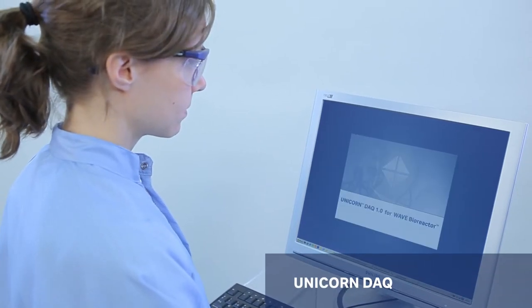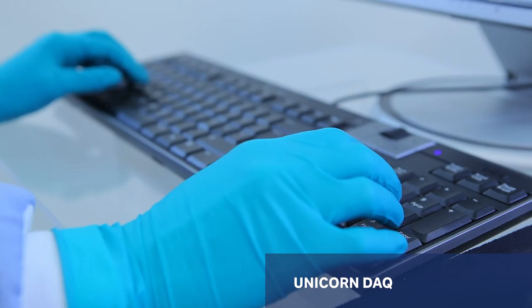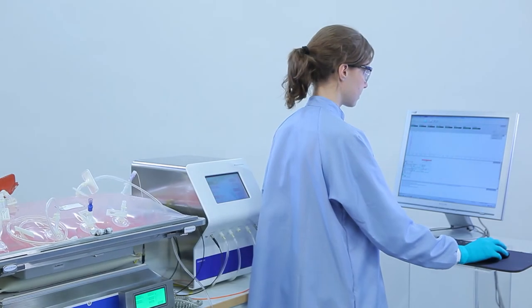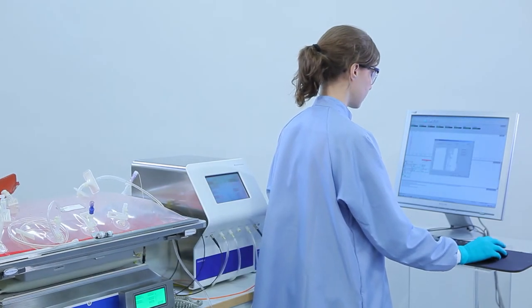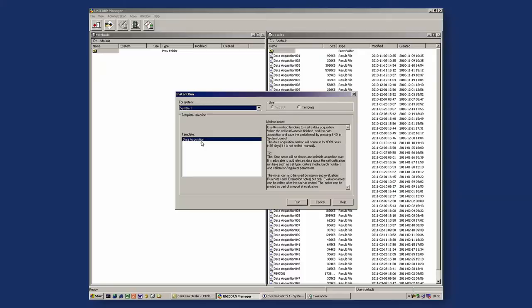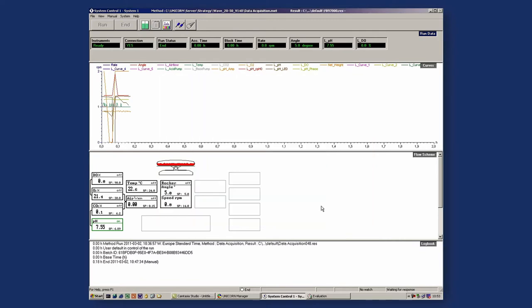Unicorn DAC software enables real-time data acquisition, monitoring, and storing of result data from a cell culture run. The software can collect data from up to four wave bioreactor systems simultaneously. To start the data acquisition, click the Run button, enter run information, and name the result file. Click the Start button. Unicorn DAC starts monitoring the data from the current cell cultivation run.